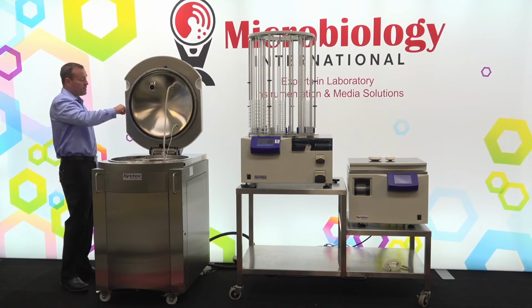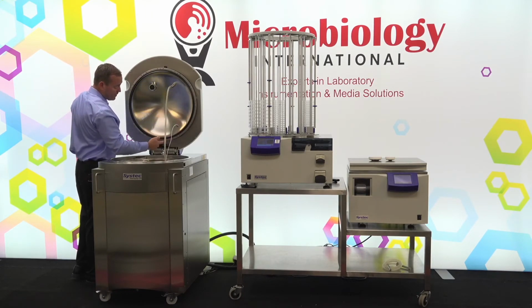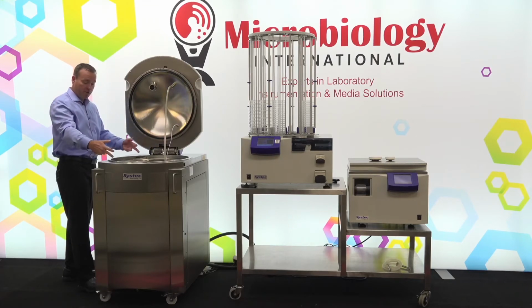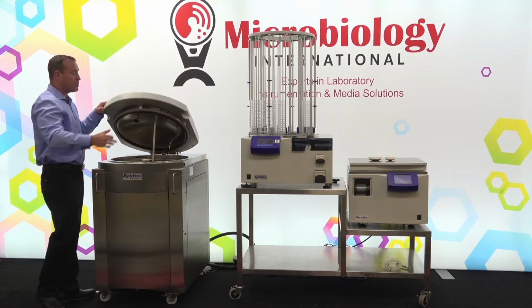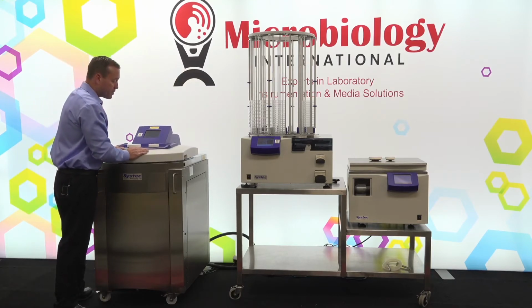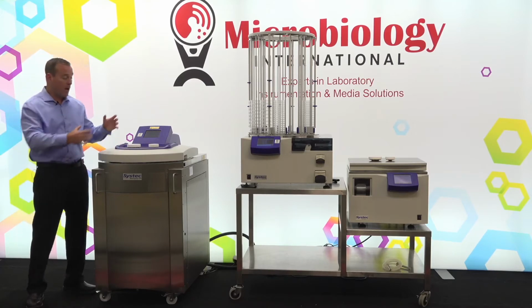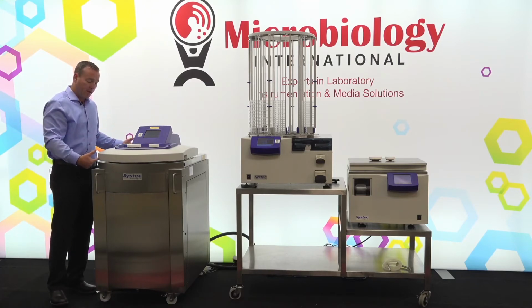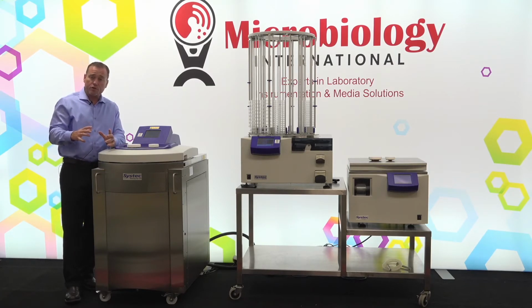But this lid is closed. There are locking sensors around the edge, and there's a locking ring in here that will close the lid down. So once we close this lid, just press it into position. It will vacuum the lid down. Once that vacuum creates, then the locking ring will go into position, and all of those sensors located in the lid all must be in harmony for us to move forward and say the unit is closed and ready to start a cycle.